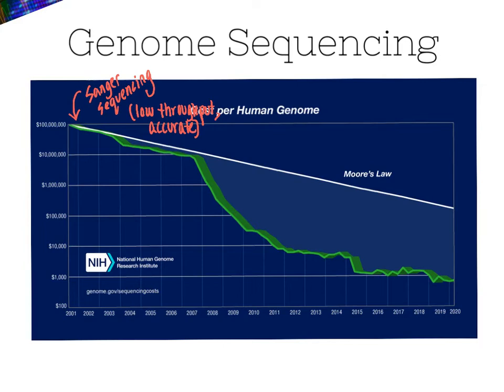Over the course of the last 20 years, the reason why the cost of genome sequencing has dropped so dramatically is because a variety of technologies have been introduced for what's referred to as next-generation sequencing. Next-generation sequencing is generally referred to as NGS. A huge variety of different technologies have been released for next-generation sequencing that have enabled a lot of competition in the market, a lot of increase in the throughput and speed with which sequencing occurs, and resulted in a drop in the price of each individual genome sequence.